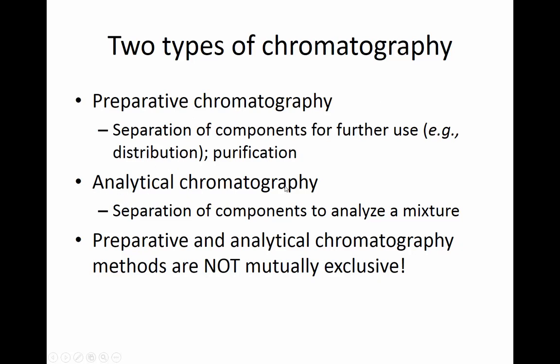And analytical chromatography is more of a fact-finding mission. Essentially, you're separating components in order to analyze what's there, to analyze that mixture. And it should be noted that these things are not mutually exclusive. You could do both. You can get a lot of data on the analytical side, while preparing your products to be polished, packaged, and whatever else.